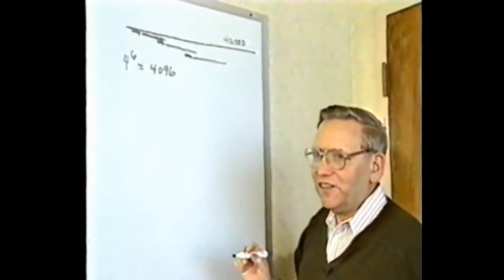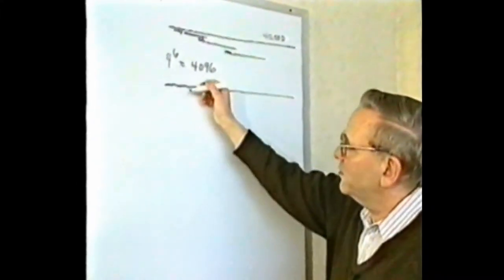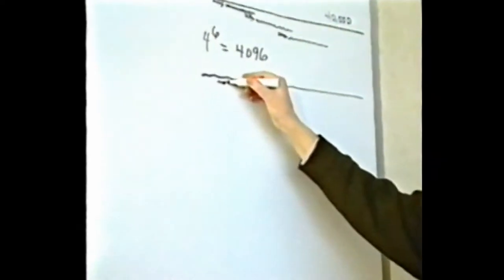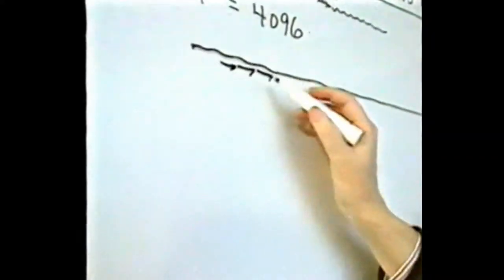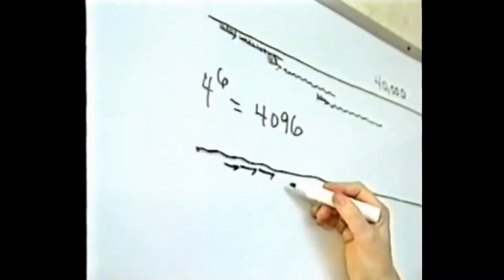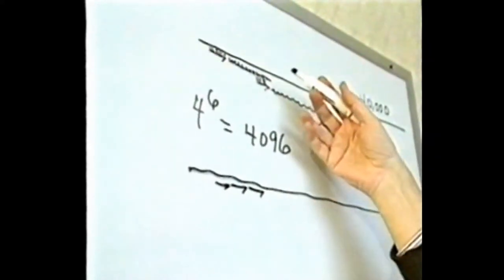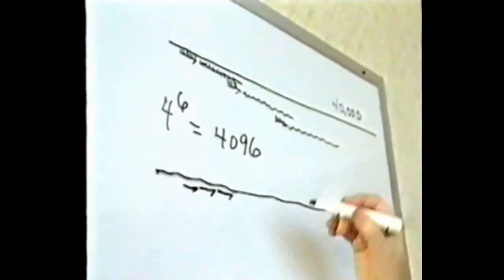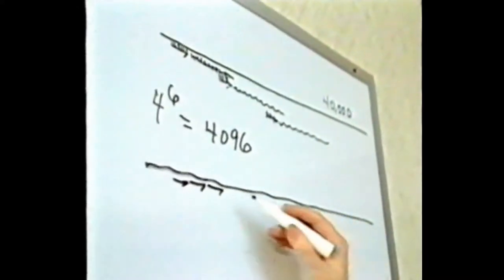But we have found a way enzymatically that you can use 3 hexamers in a row. So if you have 3 hexamers in a row, now they will prime specifically, but you're doing it with a set of 4,096 hexamers instead of something like 69 billion 18-mers. The researchers are using a single-stranded DNA binding protein to prevent the single hexamers from binding. The set of 3 hexamers are able to form a stable complex and bind specifically to a priming site.